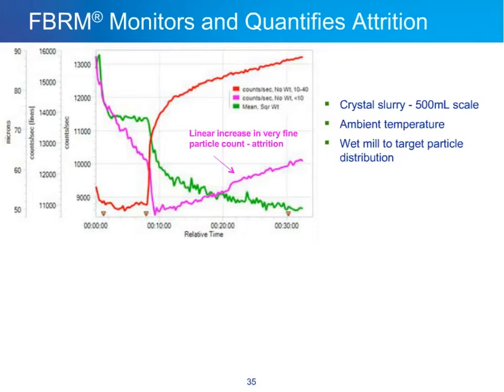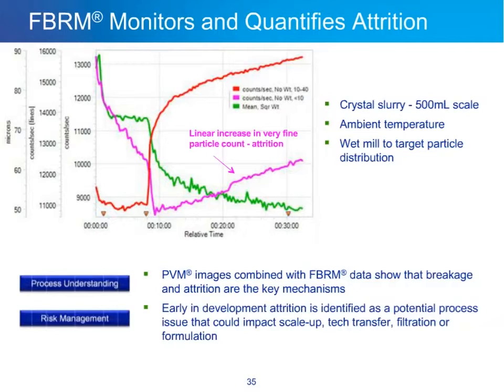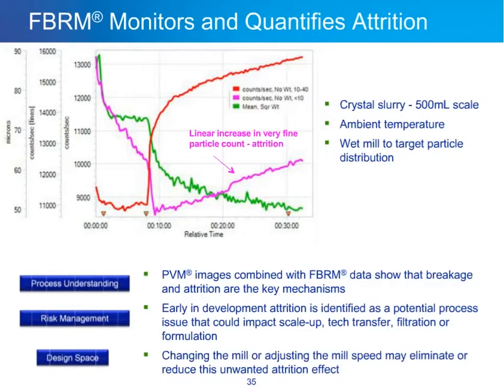This gives us process understanding: PVM images combined with FBRM data show that breakage and attrition are the key mechanisms. In terms of risk management, attrition is identified early in development as a potential process issue that could impact scale-up, tech transfer, filtration, or formulation — something we may need to eliminate or at least track and control repeatably. For the design space, we can potentially change or adjust the mill speed or other process parameters to eliminate or reduce this unwanted attrition effect.